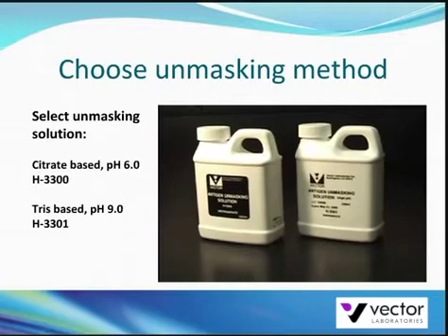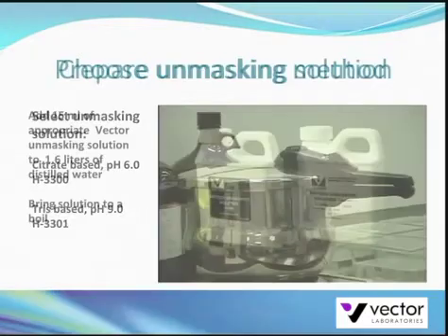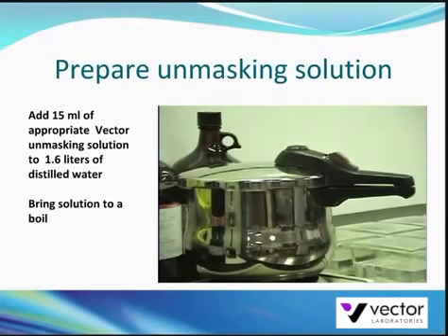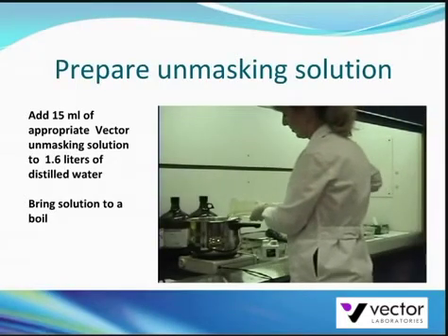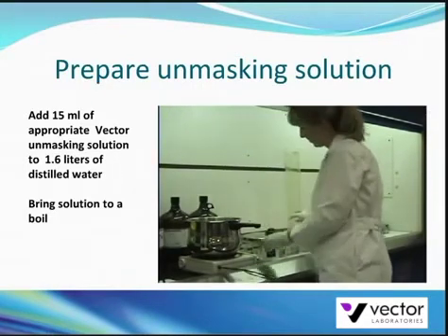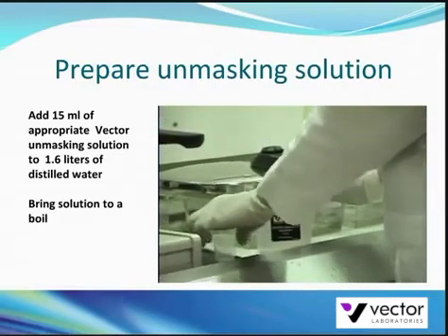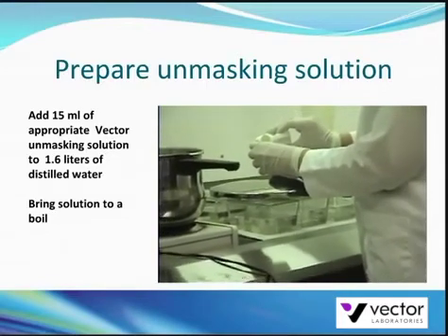Here we will demonstrate a reliable and economical technique using a pressure cooker. For the pressure cooker technique, we use a 6-quart pressure cooker available at any department store on top of a single tabletop range. Pour 1.6 liters of distilled water into the pressure cooker, then add 15 mils of the appropriate antigen unmasking solution.